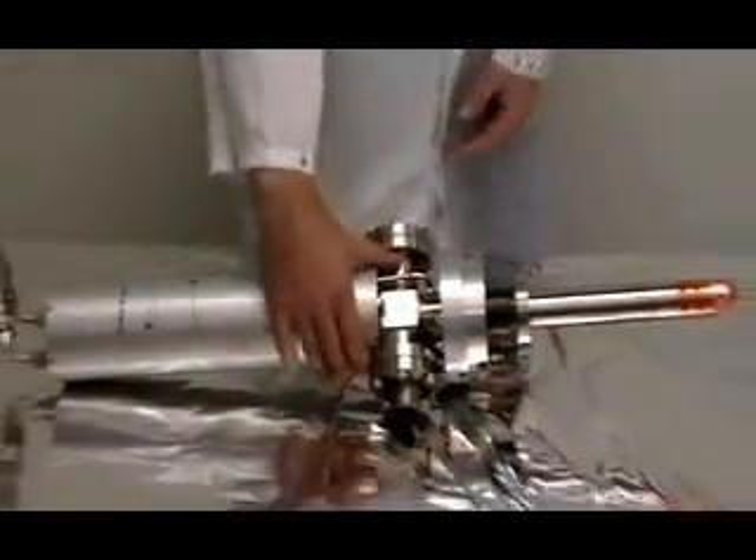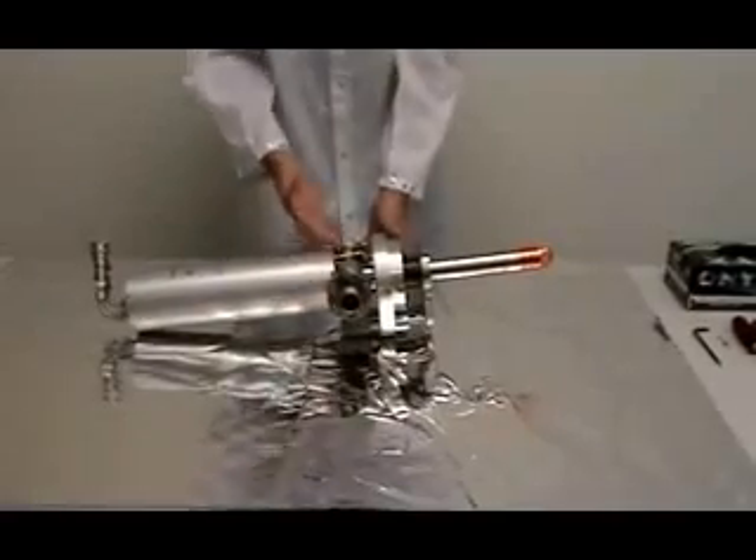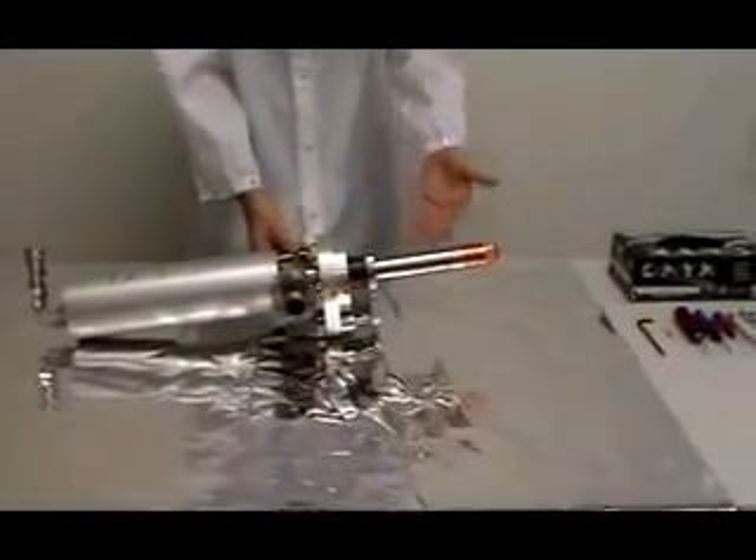The parts of the x-ray source include the water couplers, the cover, the filament feed-through, the tube, and the end cap.